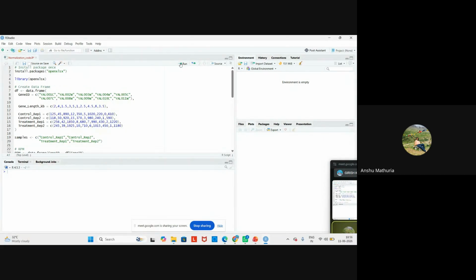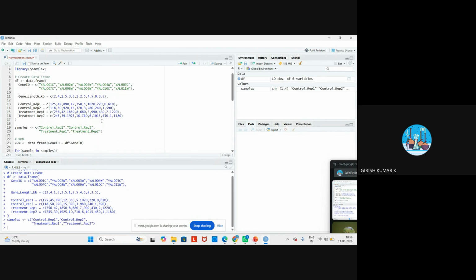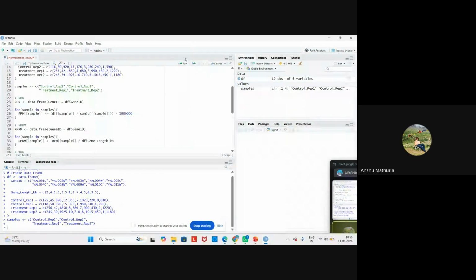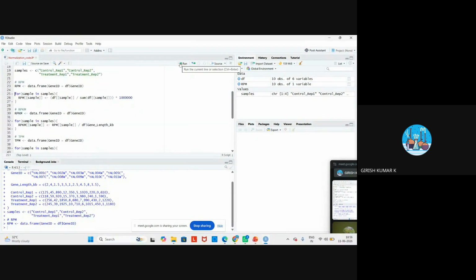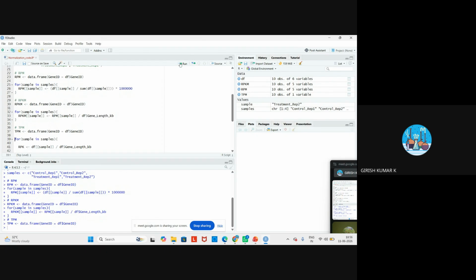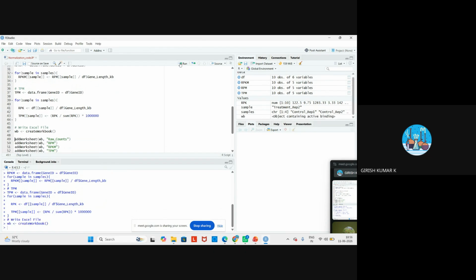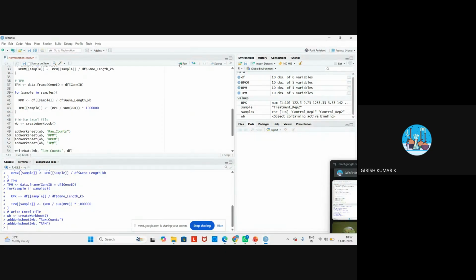And then the data frame. And then I load the samples. And then I will calculate the RPM values, ma'am. And then RPKM, and I calculate TPM with the same kind of formula in code, ma'am. And then I create an Excel file for my calculation, ma'am.